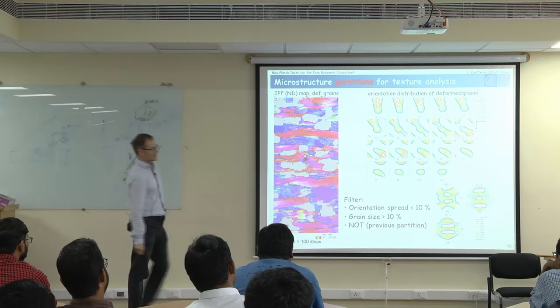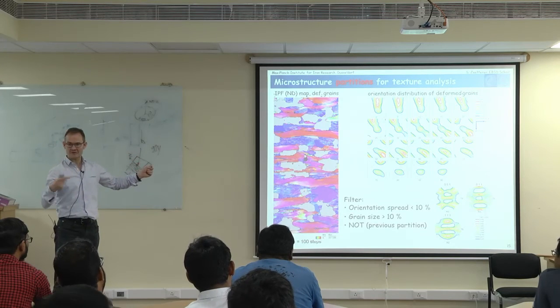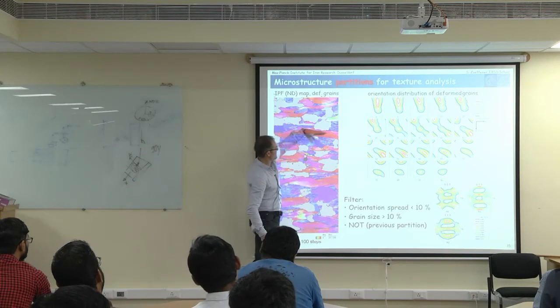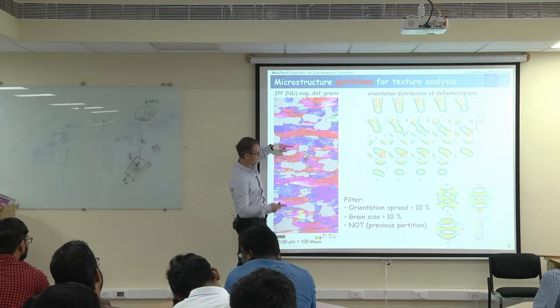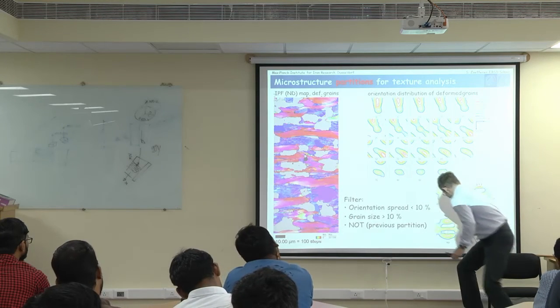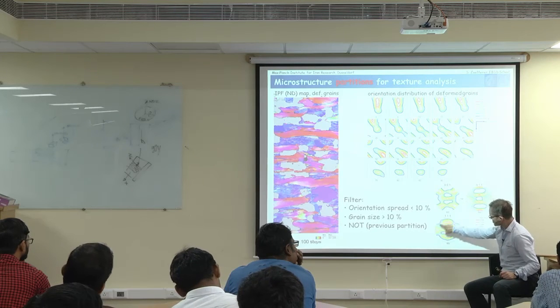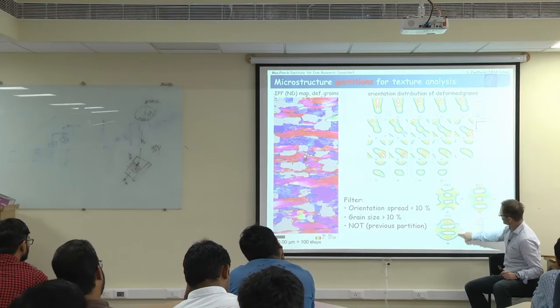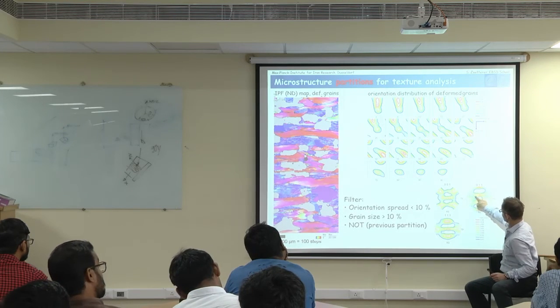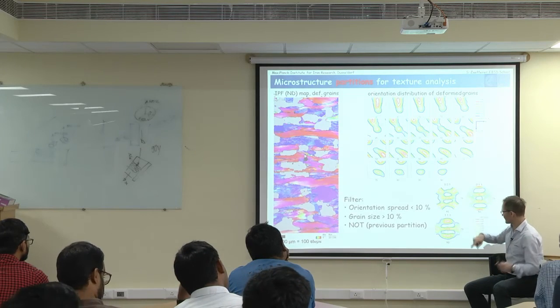And this time it's more difficult to read, because we are seeing at least two overlapping fibers, or two overlapping fractions of grains. One, these red ones, and one is these blue ones. The blue ones we understood already. They have a center pole here and a rotation around. We see this rotation barely, and there should still be the rotation here. It is there, but we don't see it so clearly because it's overlapping with another thing.